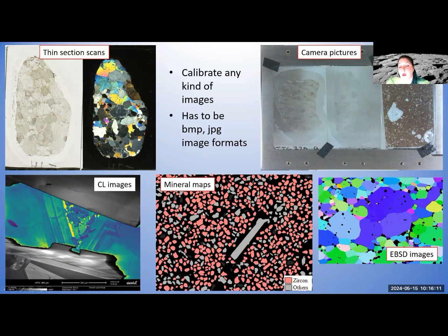We have a ChemScan MLA software that does mineral mode analysis. It's Probe Software. And so when I have that for the whole thin section, I can just use that and go straight to the grains that are shown as my desired target. Or you could also combine it with EBSD images, or again, whatever you want to use.